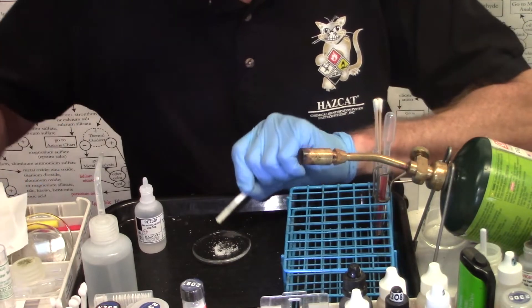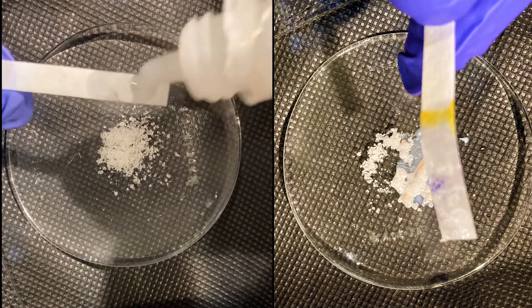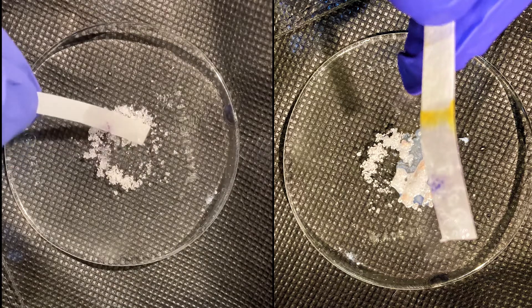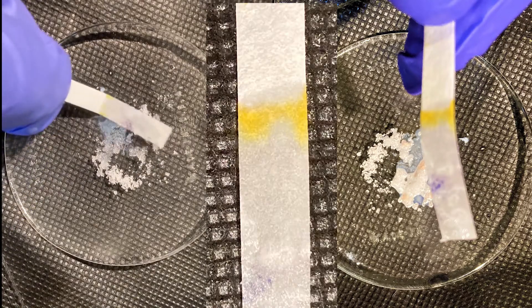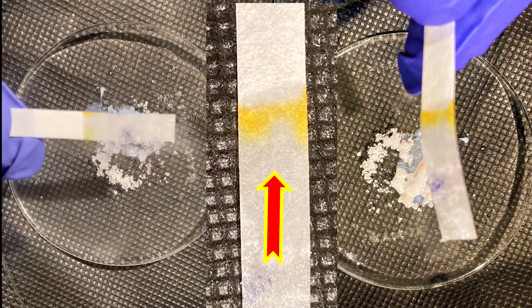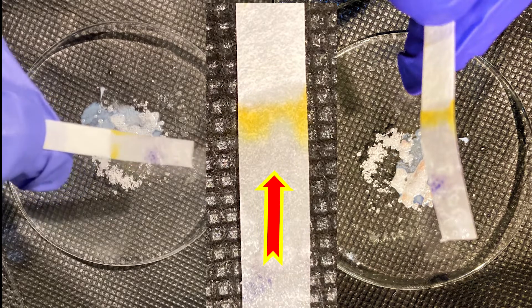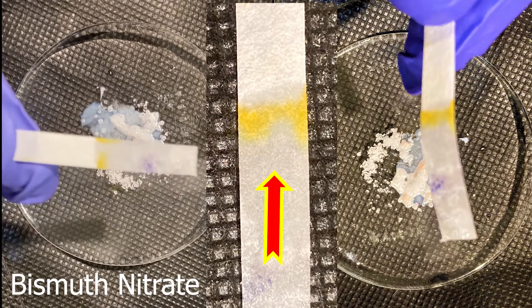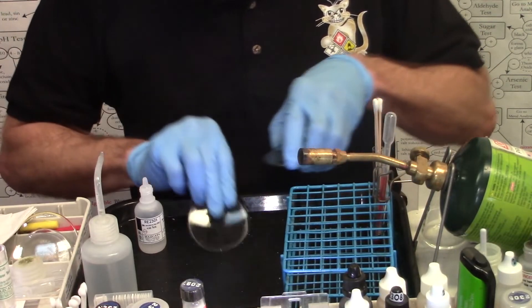Now if I examine the paper very closely, I can see that it has some little yellow spots on it where the unknown came in contact with the oxidizer test strip where the crystals of the white solid came in contact. So that's not a positive oxidizer. But that yellow is an important observation. This substance was bismuth nitrate. Let's try another one.